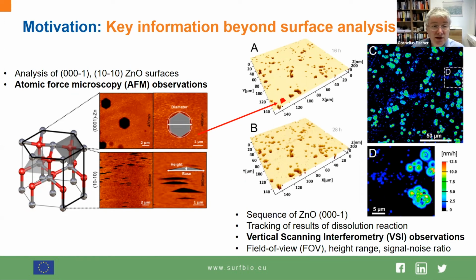Second thing is, with very high precision in the nanometer and sub-nanometer range, the sensitivity, the vertical resolution, is more or less equivalent to what we know from AFM. We are able to analyze the topography, the height of the material under investigation. So, large field of view, but identical vertical resolution. And another very important point here: it's a really beautiful signal-to-noise ratio that this technique does provide. And this led to a number of interesting applications.